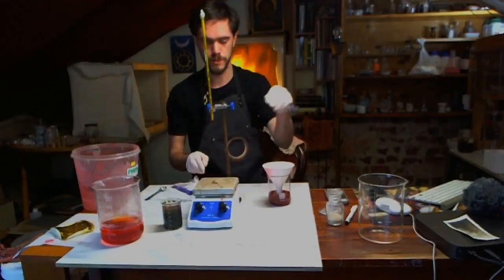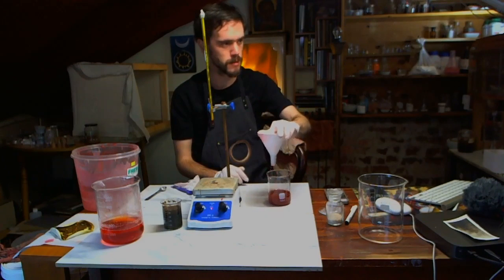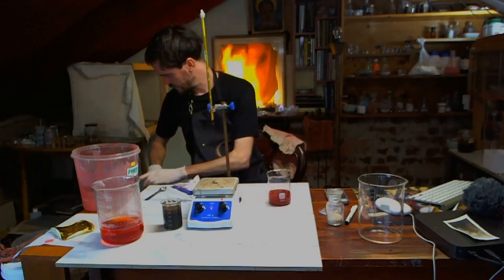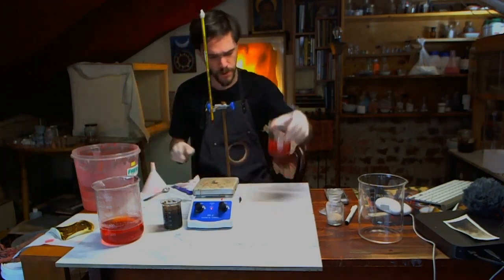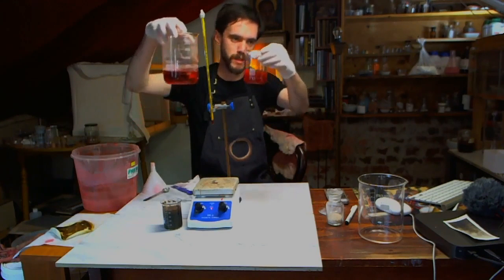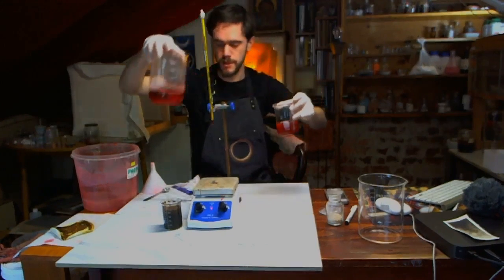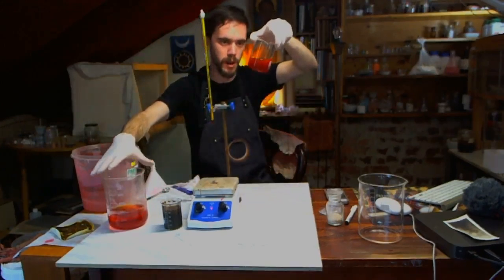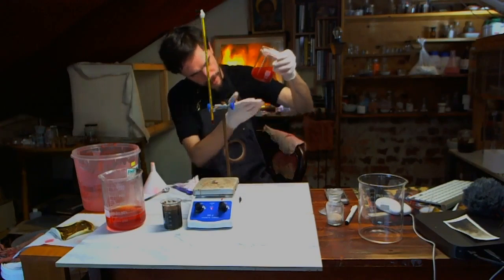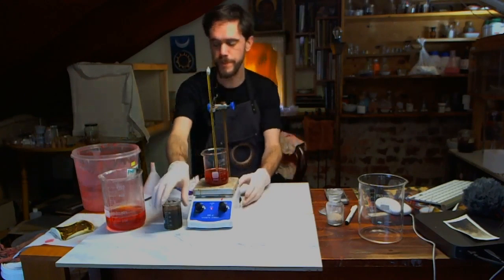Get our hot plate on and warming up. It's hard to tell. I know this has already had an extraction from it, but there's definitely a difference in the color. And it's quite cloudy at the moment, which I'm not sure if that's just because it's cold and we need to heat it up. So we'll see if heating it up has an effect. So, thermometer in there, we'll get this warm.